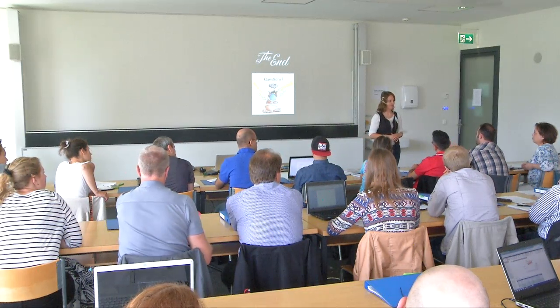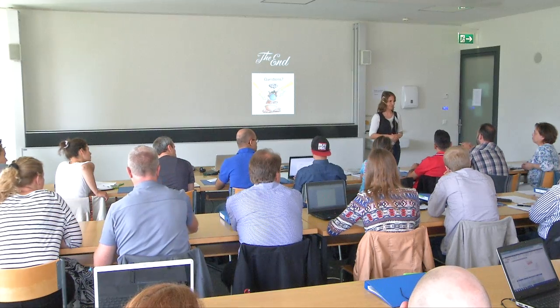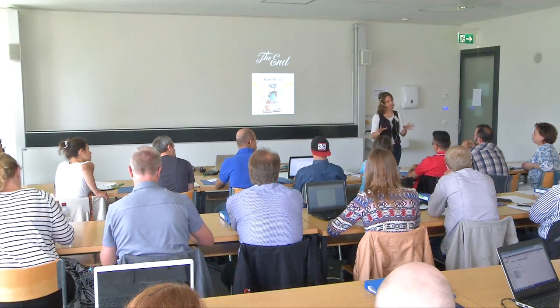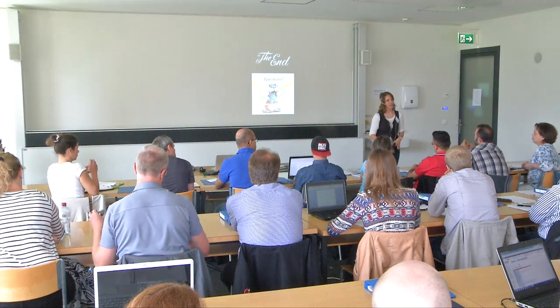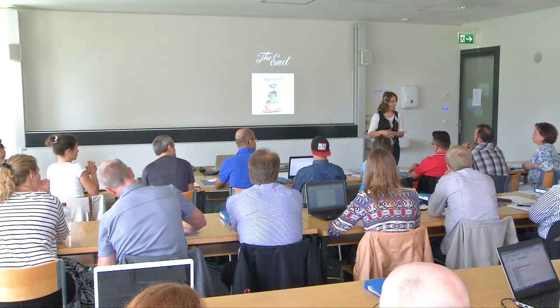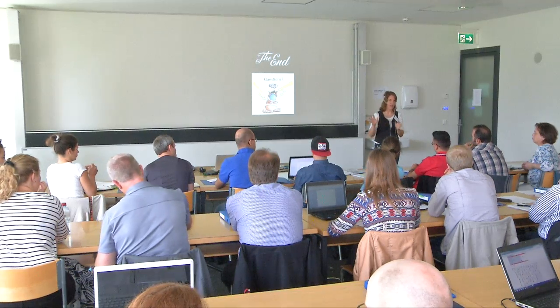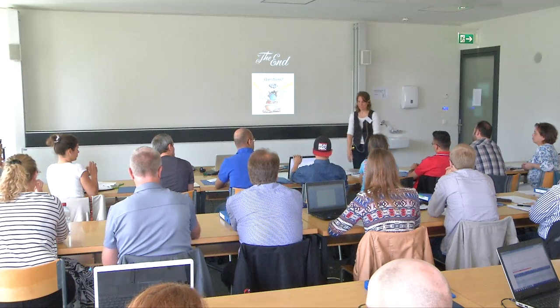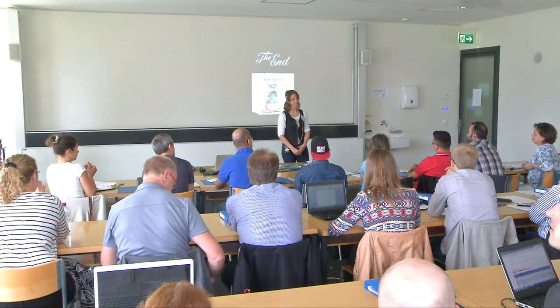And label-free? Yeah, sure. There are many papers out who have done this. Of course, you will have disadvantages in terms of run-to-run variations, in terms of higher CVs, and all these things that apply exactly the same way also to shotgun label-free anyway. But there's no reason why you cannot do this in your data.